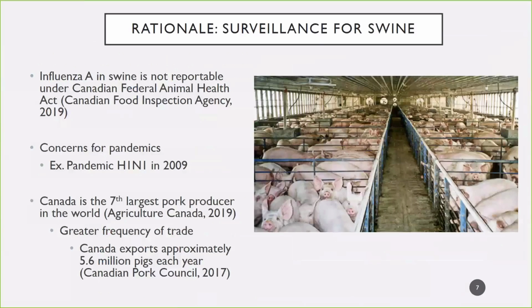Next slide. Why is it important to have surveillance for swine? Influenza A isn't reportable under the Canadian Federal Animal Health Act. There are concerns for pandemics, for example the H1N1 pandemic in 2009, which originated from swine. And Canada is the 7th largest pork producer in the world. Since there is a great frequency of trade, including live pig exports and imports, these can also serve as occasions for reassortment events. Next slide.